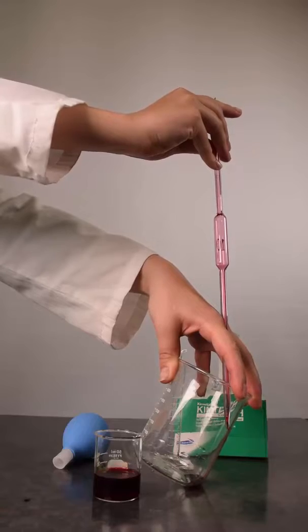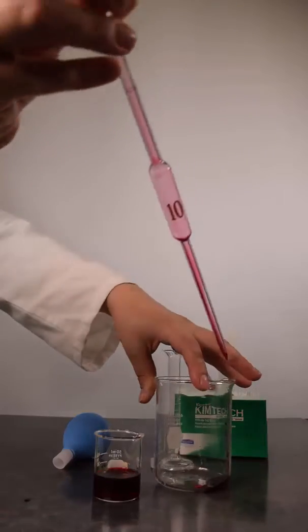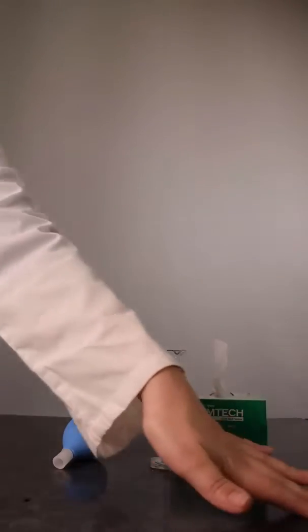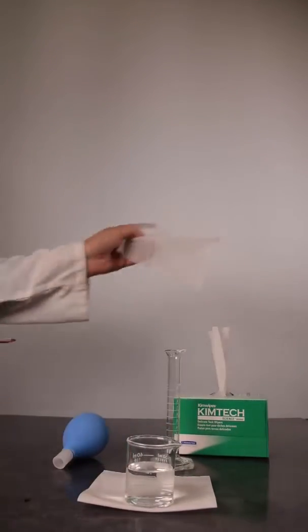We will now demonstrate rinsing this pipette clean with deionized water without contaminating the beaker of water with the dye. We will pour the rinses into a 10 milliliter graduated cylinder to show the total volume of rinses.